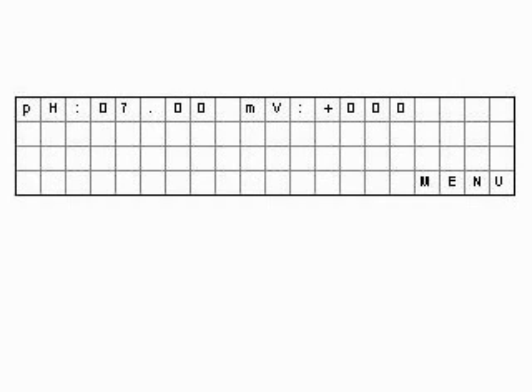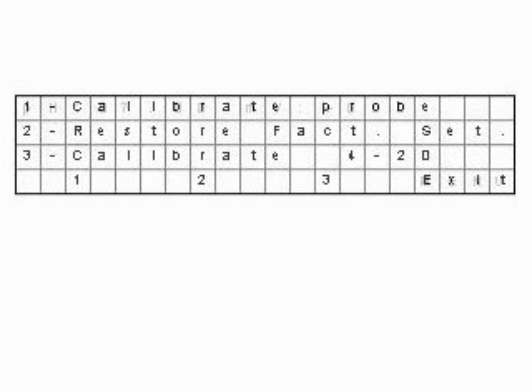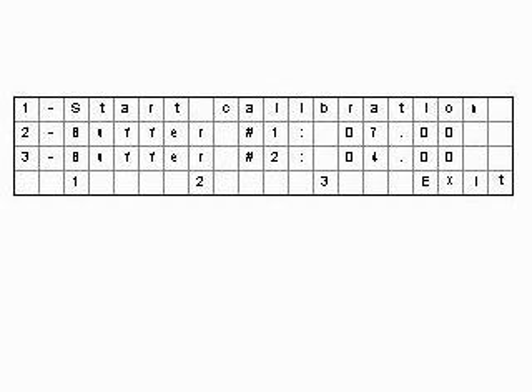The main screen will show the pH value and the millivolts coming from the probe. The only option here is to enter the menu. If we do so, we will see the main menu. The first option leads us to the calibration menu. In this menu, the second and third options can be used to change the value of the buffer solutions, showing screens like this one.